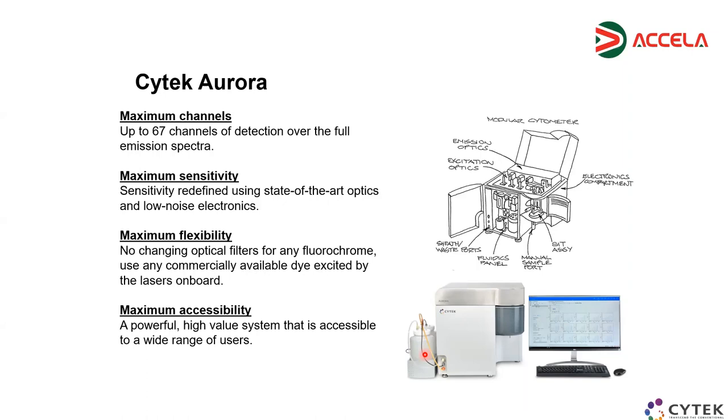I didn't develop this panel personally. I can ask, if you want, about what they are used for. For what I know, I got the data sets. There was no FMO used for this 23. If you are talking about the 23 antibodies in one tool, I didn't see the FMO.